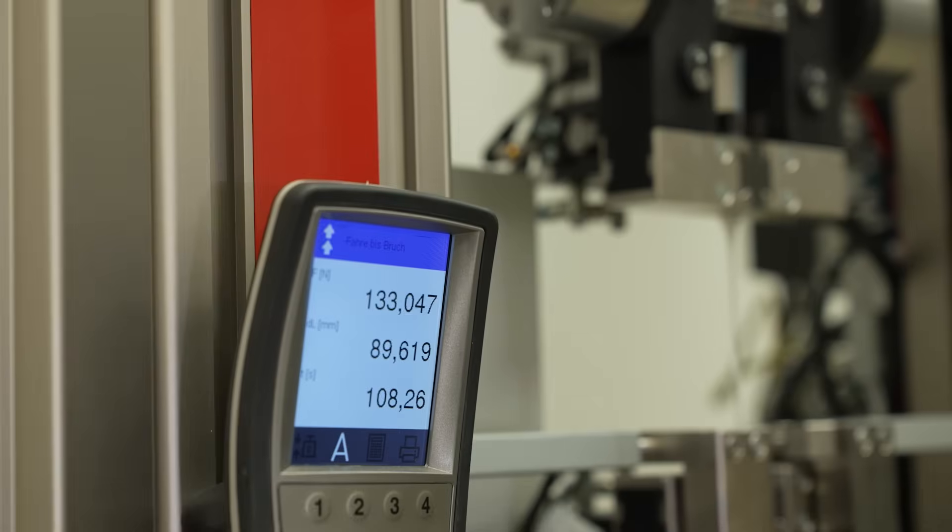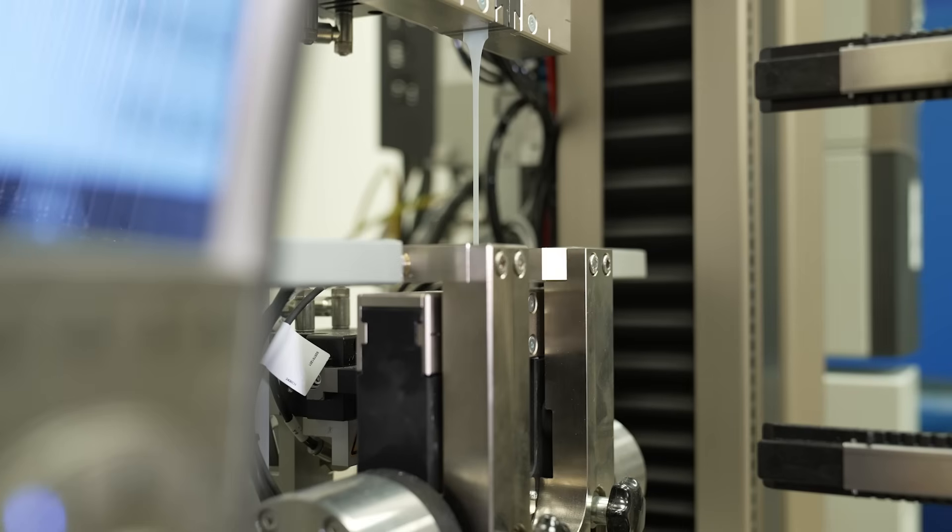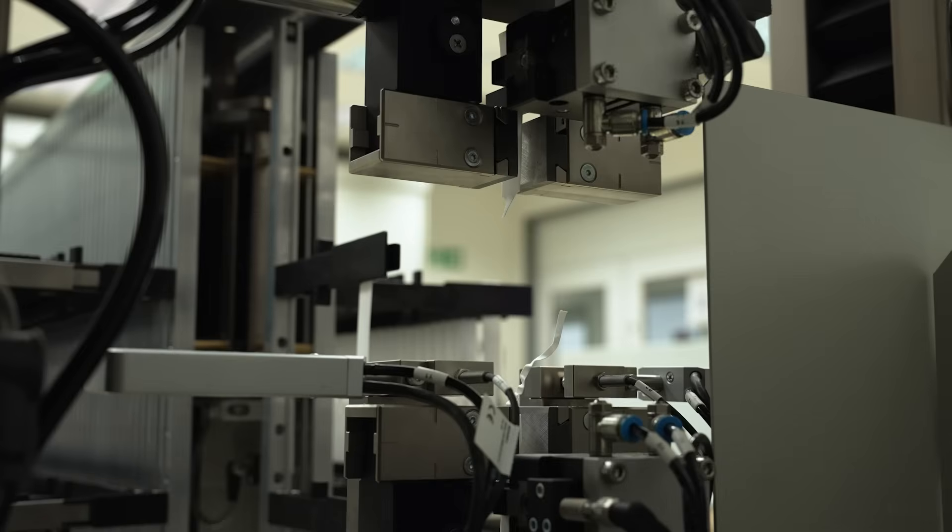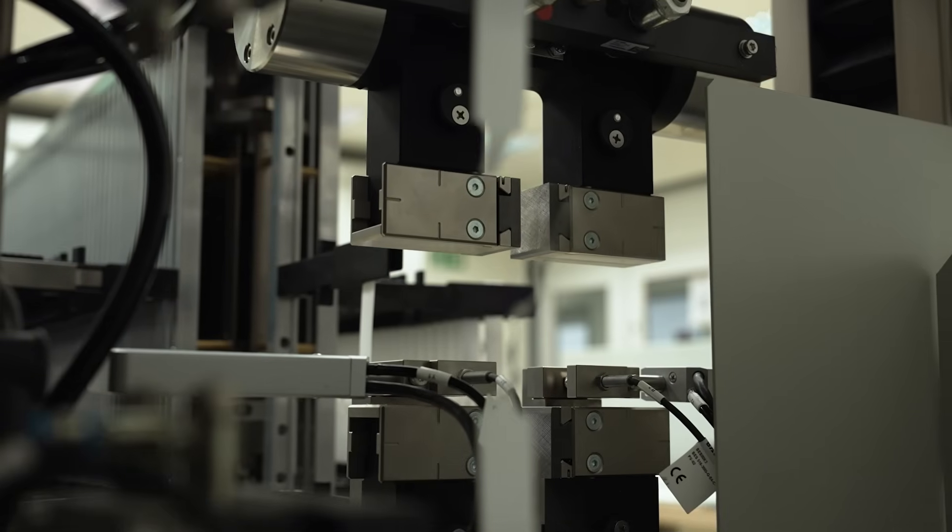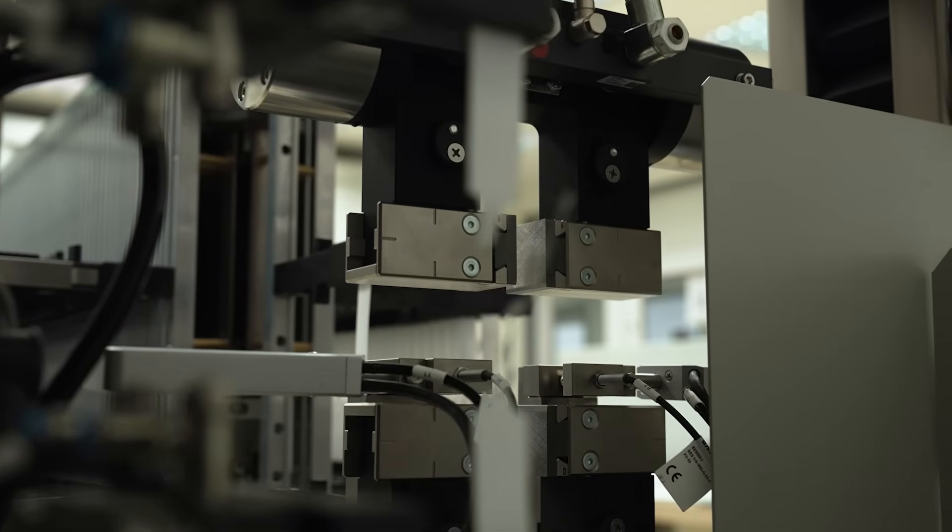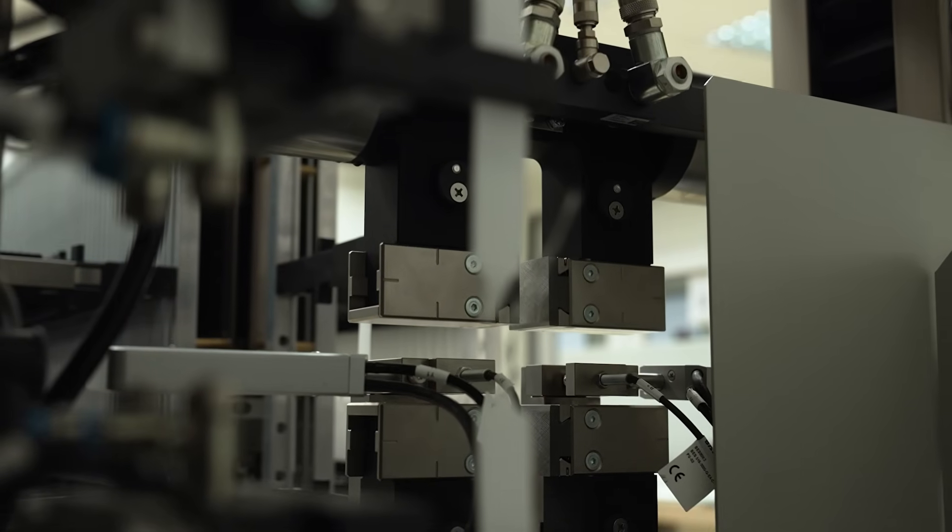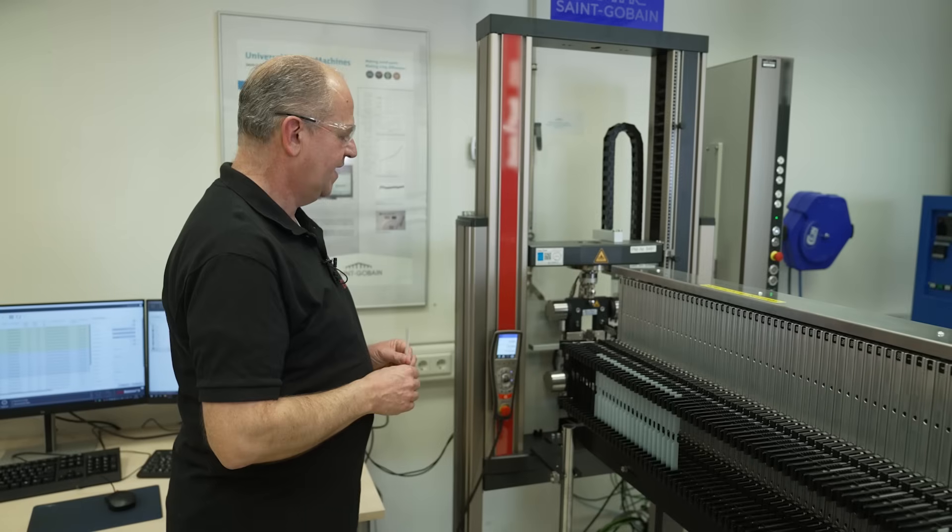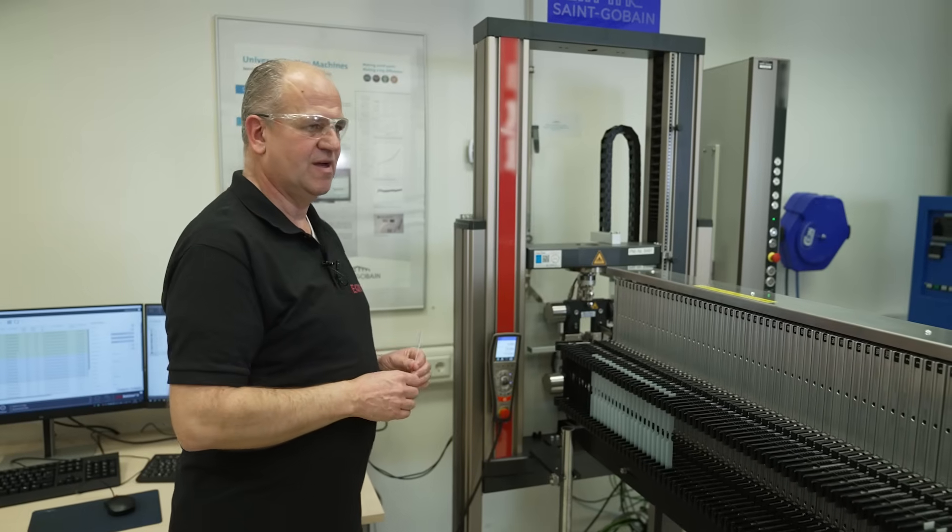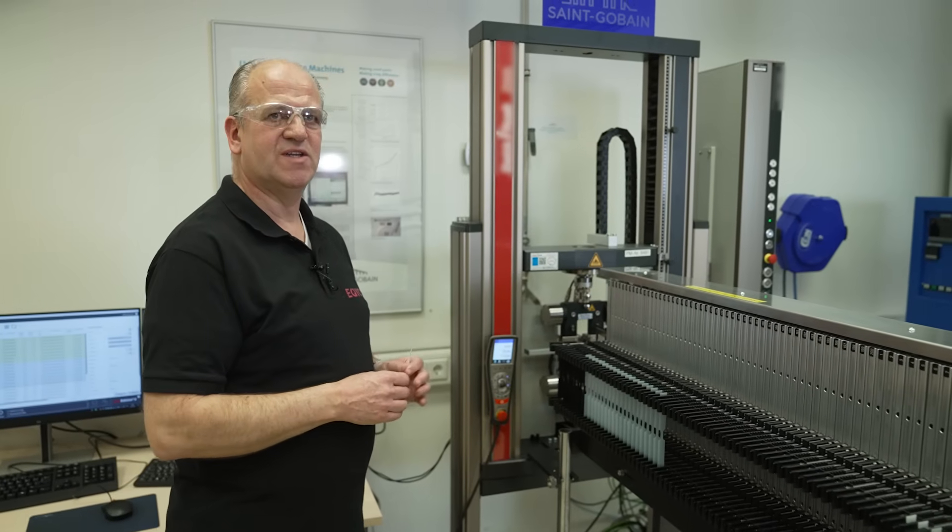Once the sample is broken, the machine is directly removing the sample out of the clamping, and that's what is going on here.